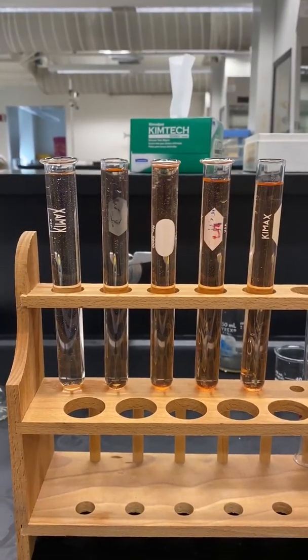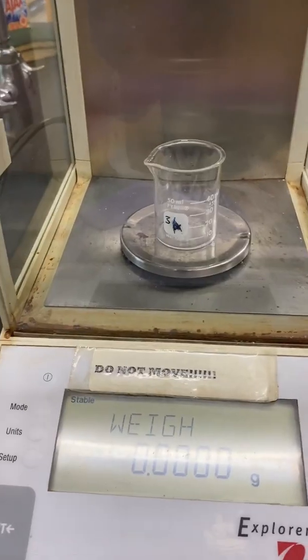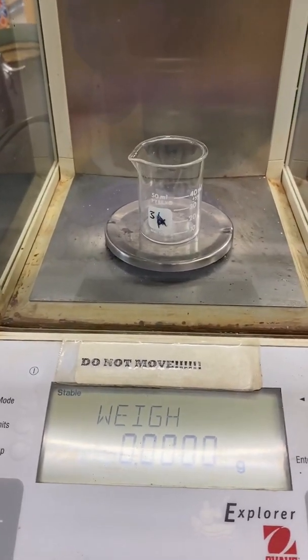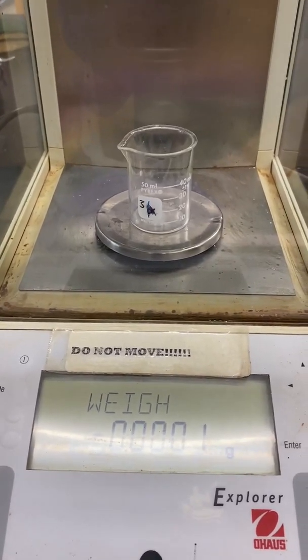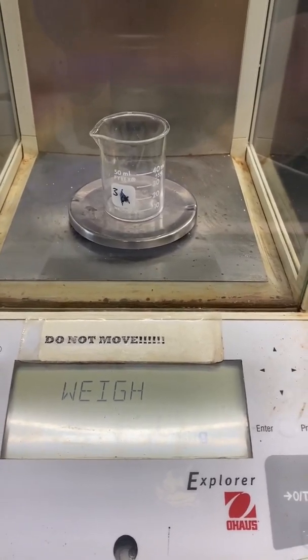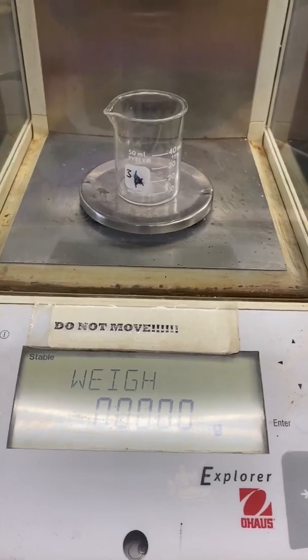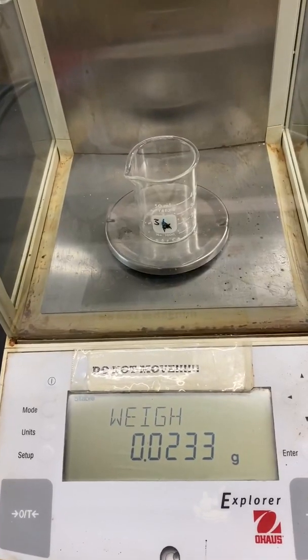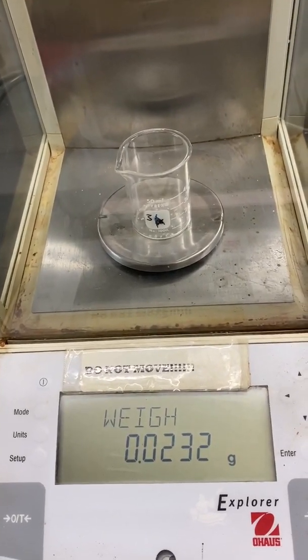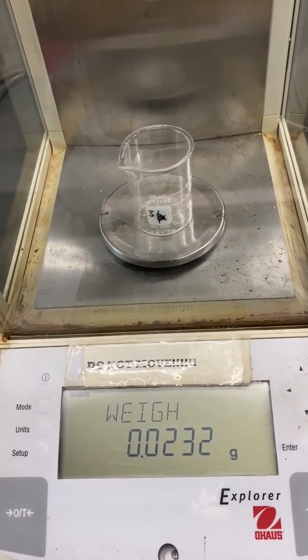You should now have 5 solutions A through E. While partner number 1 is making solutions A through E, partner number 2 should prepare the unknown. Tare a small dry beaker on the analytical balance. Weigh about 0.0245 grams of the unknown iron into the beaker and record the exact mass.